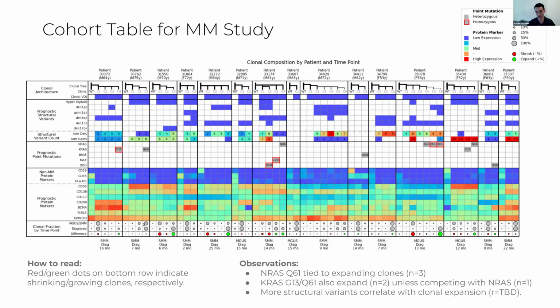All right, so I just showed you 3 samples. We can put all of this together in a huge table, which is a little daunting when you first look at it, but what's helpful is to scan the bottom, and you can see these red dots and these green dots. And what you're looking for are commonalities between the green dots and commonalities amongst the red dots. And that helps you understand, these are pre-treatment samples, but you can imagine with relapse time points with some sort of therapy, this would help you understand maybe why a treatment across a cohort is working or is not working.